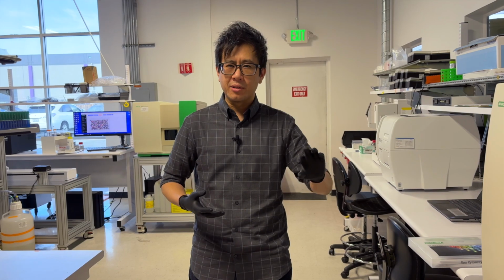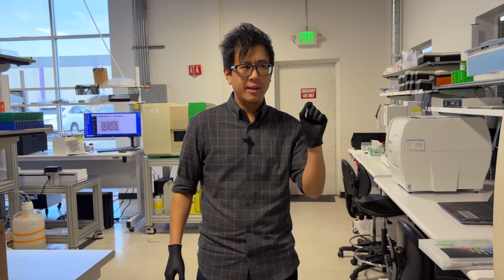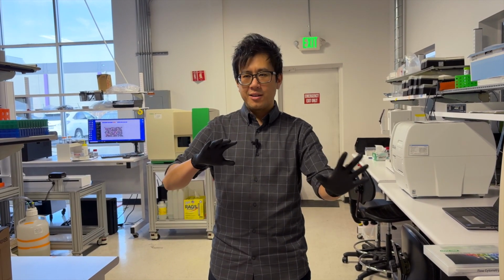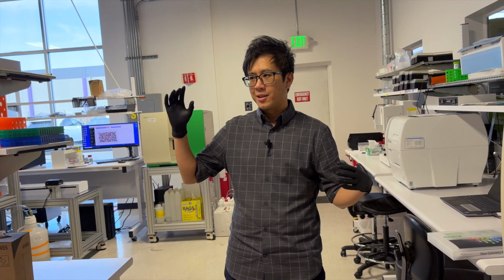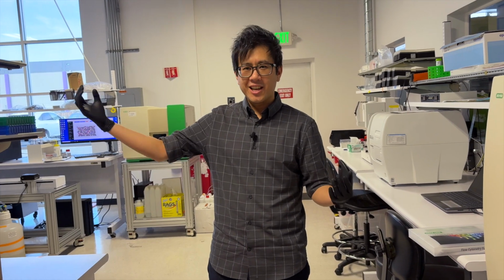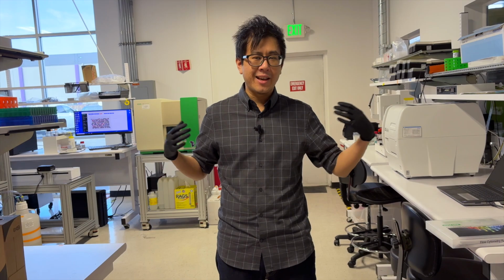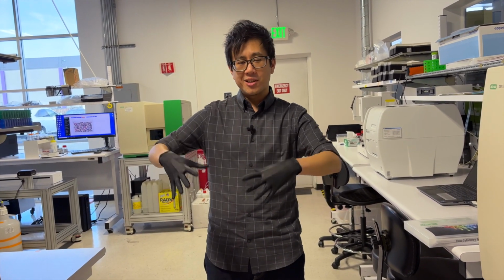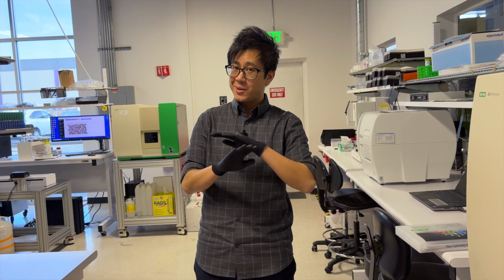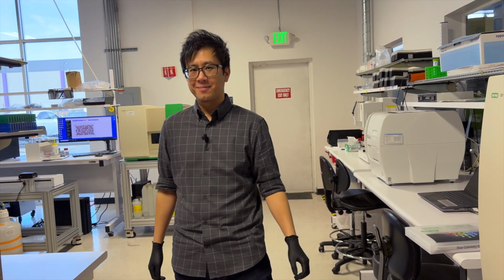We knew what we wanted to build. We knew how we could build it. And for us specifically, it was building it exactly the way that we wanted, customized just for us. And that also means we think about science in a particular way. The schemas, the columns that we'll have for certain tables map to how we naturally think about our experiments. And so we built our LIMS perfectly for the way that we, as scientists, think about our science. So it's great for Eigen. If you were to take our LIMS and give it to another company, it would probably be terrible, because most companies think about science in slightly different ways.